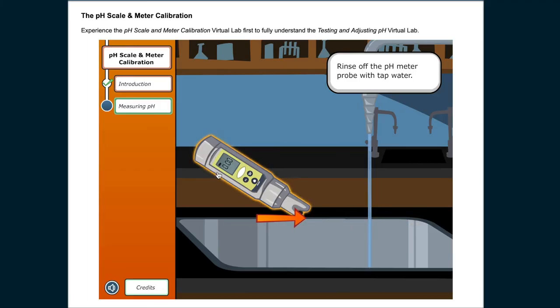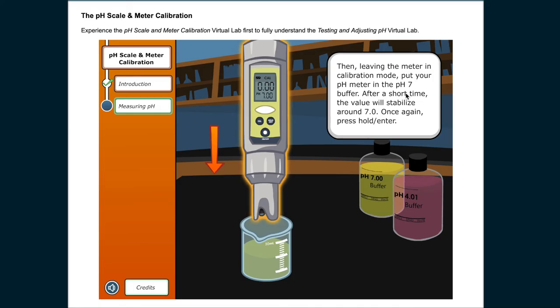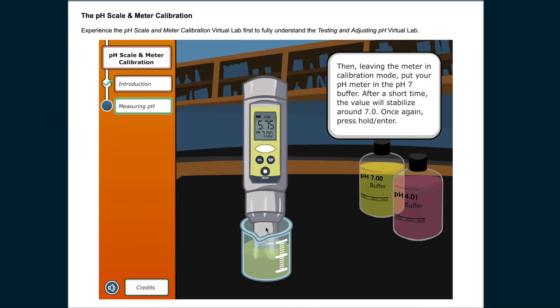Rinse the pH meter probe with tap water. Then, leaving the meter in calibration mode, put your pH meter in the pH 7 buffer. After a short time, the value will stabilize around 7.0. Once again, press hold enter.